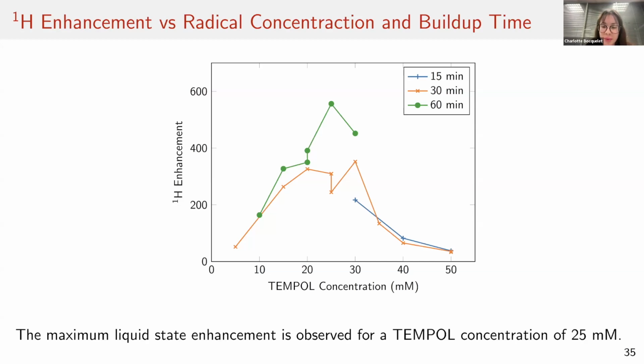There is another question from Asif. Could you explain again why you had to freeze the bullet outside before loading it into the polarizer? Yes. Okay. Actually, first we tried not to. We tried to just fill the bullet, and then the idea was that we would gently lower it into a nitrogen dewar. There would be a tube sitting in a nitrogen dewar. We built all these things. And then we would maybe have a stream of gas that would keep the bullet in position, or just slowly lower it into the nitrogen dewar.